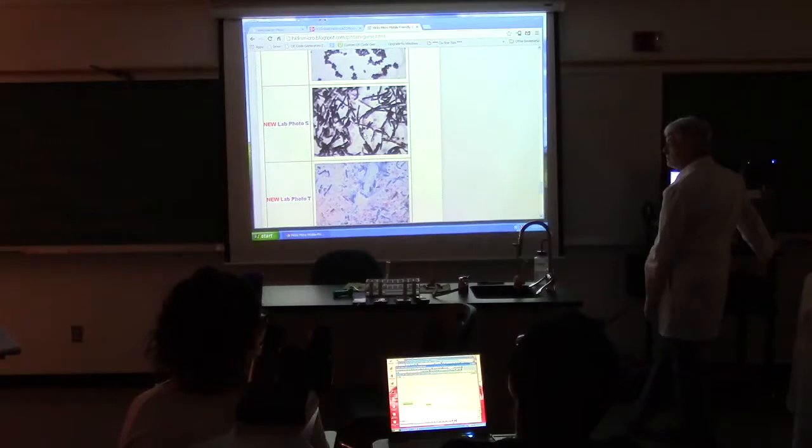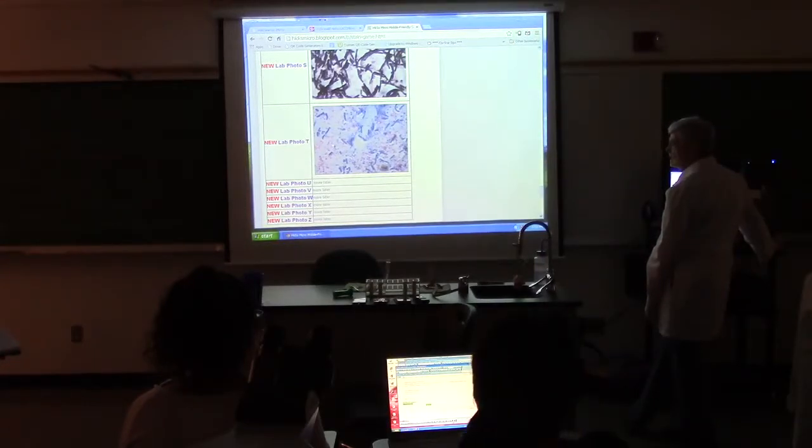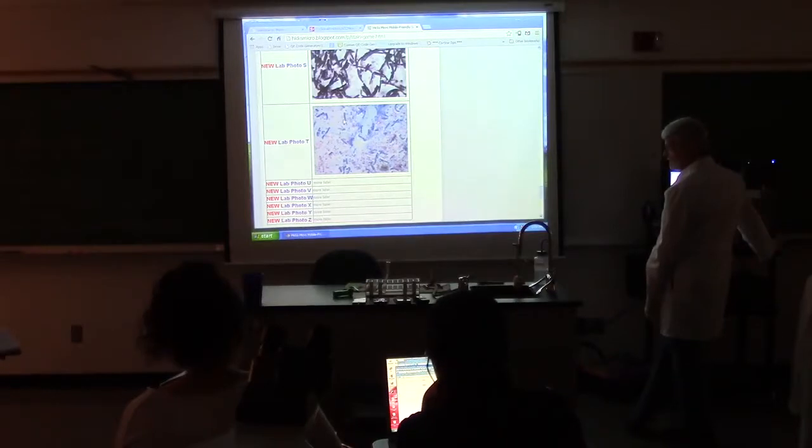What's this one? Acid fast stain, positive or negative? Negative. Those are blue rods. The hot pink things are eggs. Endospores. Don't be fooled. Egg-shaped things that are hot pink are not acid fast positive. You're looking for the cell. What's the cell? The big long thing. That's the cell. What color is it? Blue. That's all that matters.